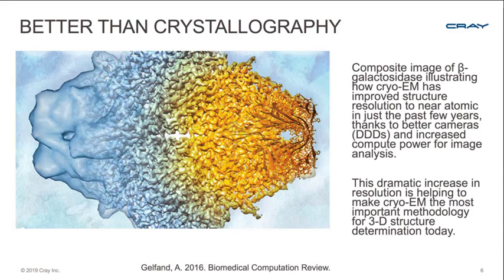Before this resolution revolution, Cryo-EM was sort of referred to dismissively as blobology, but now it's becoming a very important tool. My title for this slide is Better Than Crystallography, and that's probably a bit cheeky, actually.